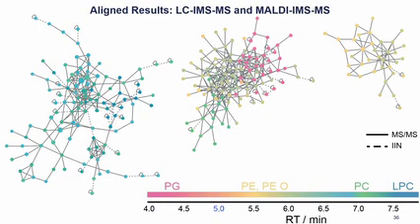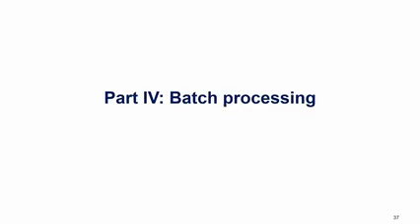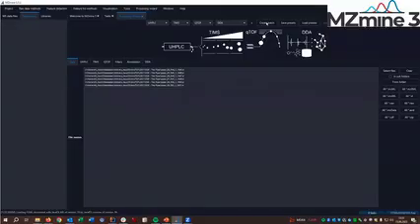So this is quite a powerful way how to combine different types of data sets. Now, what I would like to show you is that this actually doesn't have to be difficult and doesn't need to take much time, because I mentioned we now have this wizard, and the wizard creates batch steps for you. So by selecting what type of analysis you want to do, you can create a batch, and then you can just load your files and you can run your batch.